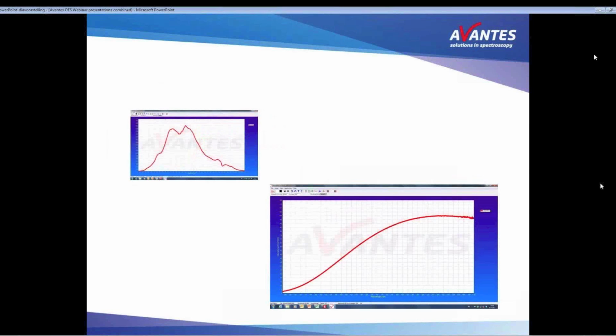Here we see an important part. In order to measure light intensities in a good way, one needs to intensity calibrate the system. At the right bottom corner, you see a typical spectrum of a halogen light source with a smooth curve going up from 350 nanometers far beyond 2000 nanometers. When one observes the same light source with a spectrometer and only displays the raw data, one will see a graph as displayed in the left top corner. So one needs to determine a transfer function which translates the raw data from the left top corner to the absolute data at the bottom right corner.